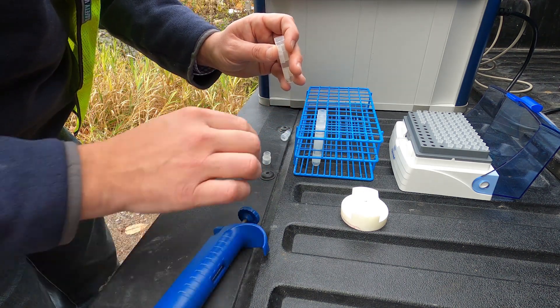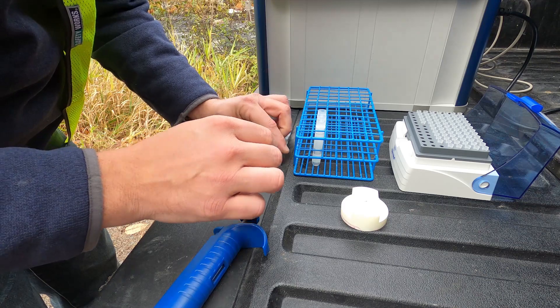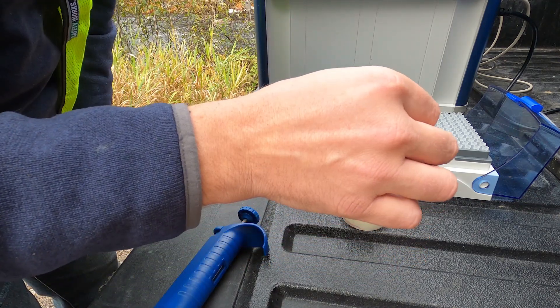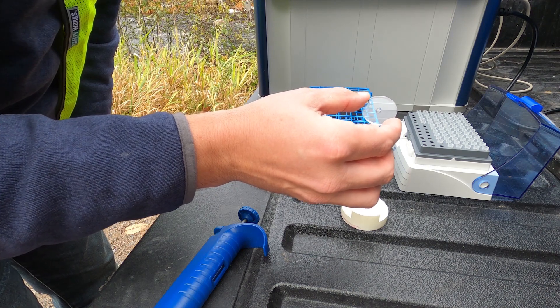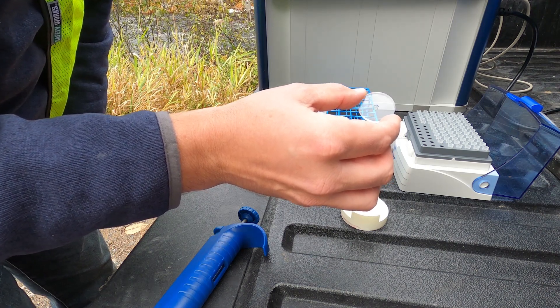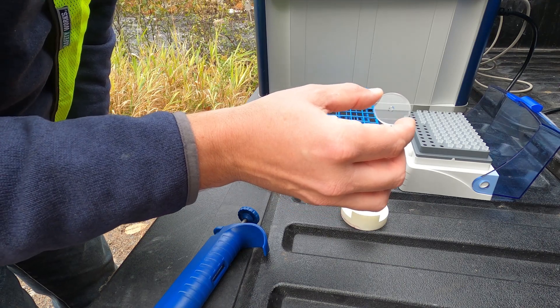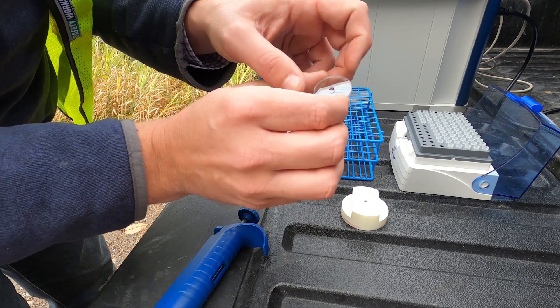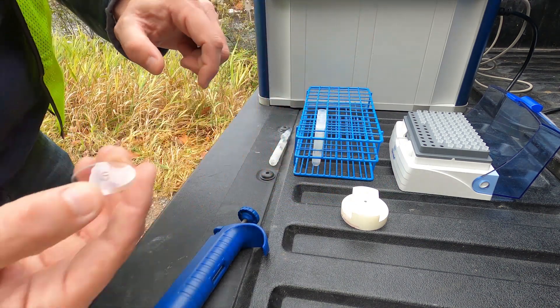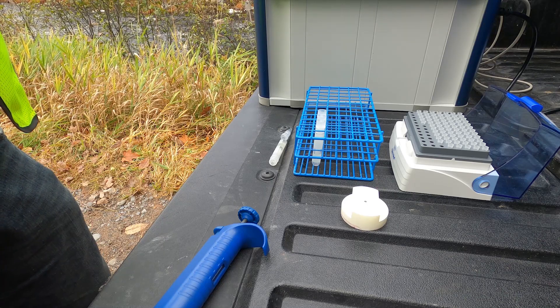Now that we've pipetted the water directly onto the center of that disc, we will take that disc and dry it using a hot plate. Once the water is perfectly dry onto that sample carrier, you will see a very thin film directly on that carrier, and from there we can load the instrument and start our analysis.